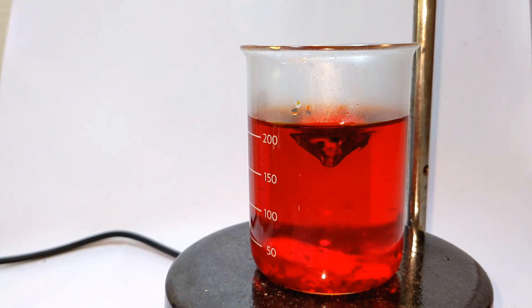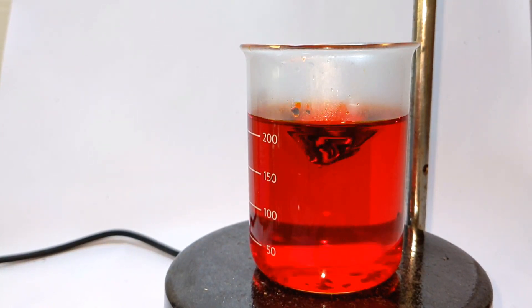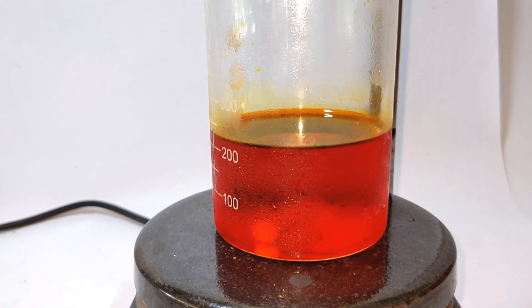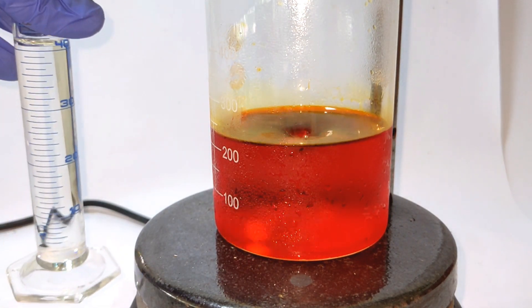Chromium trioxide, or chromic acid, is a very strong oxidizing agent which is corrosive as well as carcinogenic, so be extremely cautious while handling this chemical. The solution was then transferred to a bigger beaker and cooled down to around 0°C.